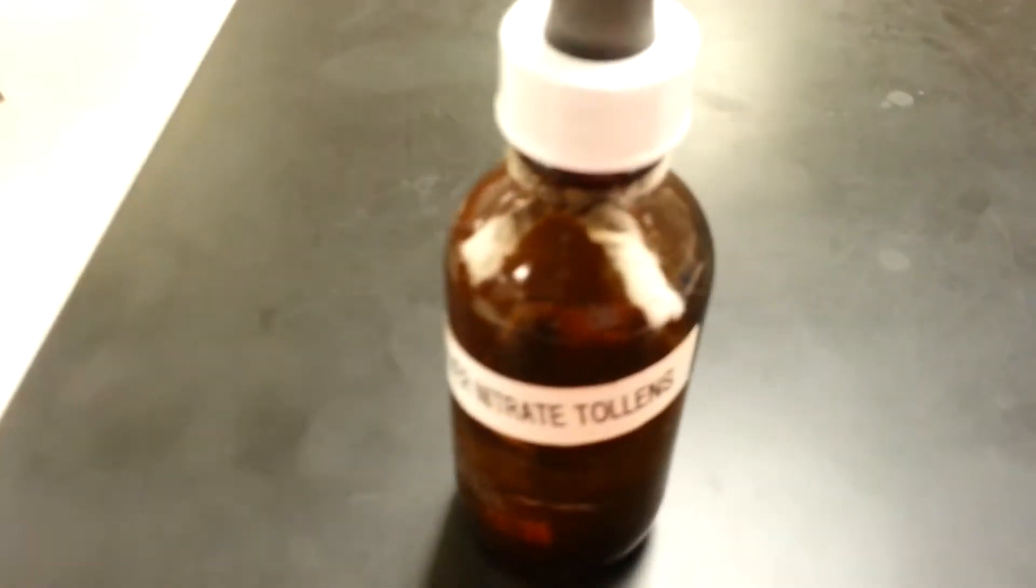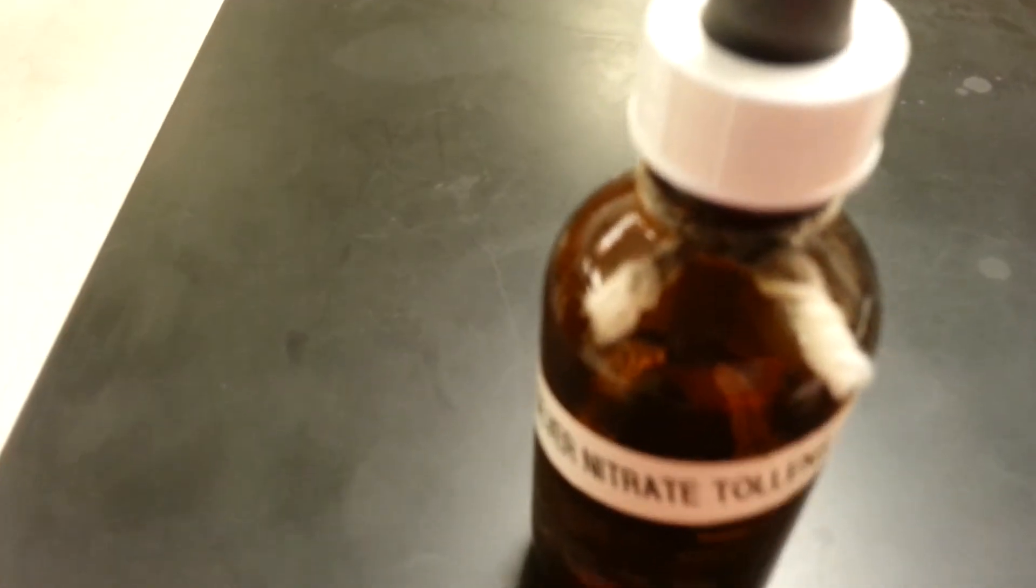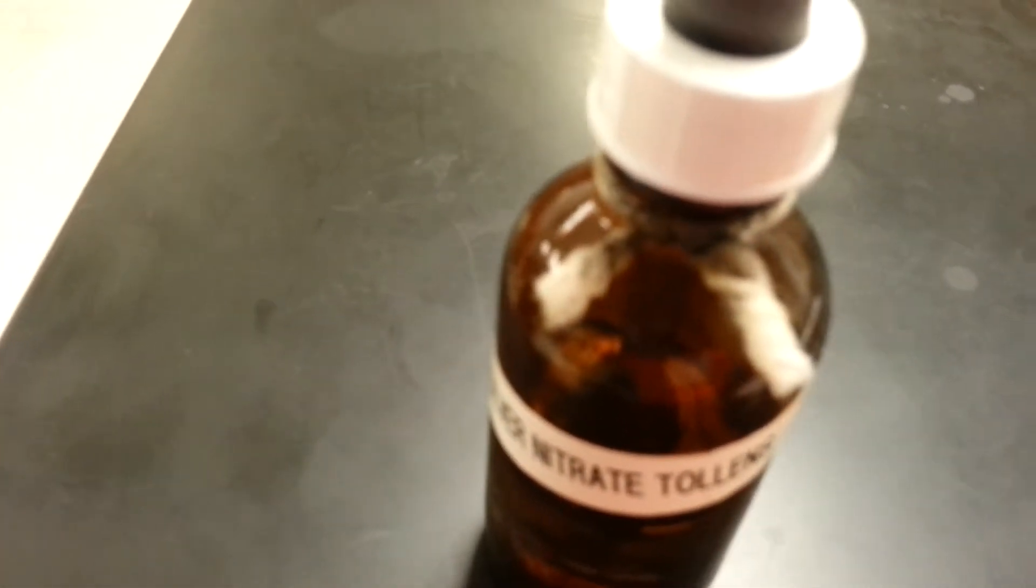And here we have Tollens Reagent, atomical silver nitrate Tollens Reagent. You add sodium hydroxide solution to silver nitrate to form a precipitate. Then you add dilute ammonia solution until precipitate dissolves.